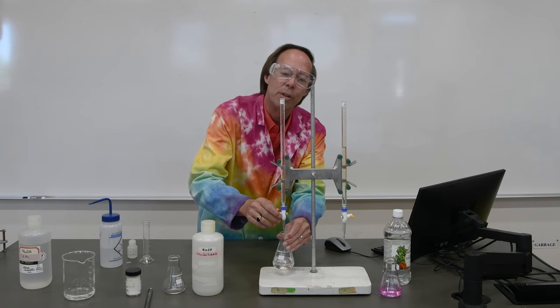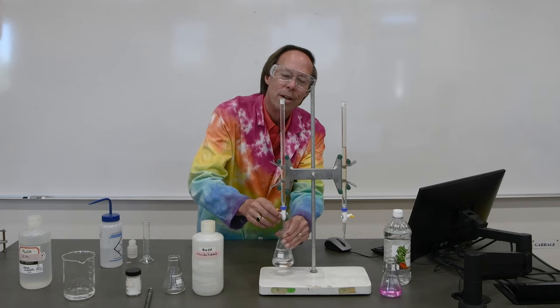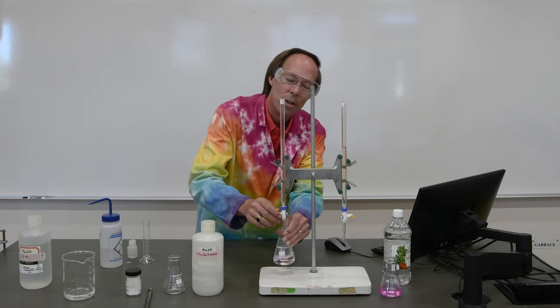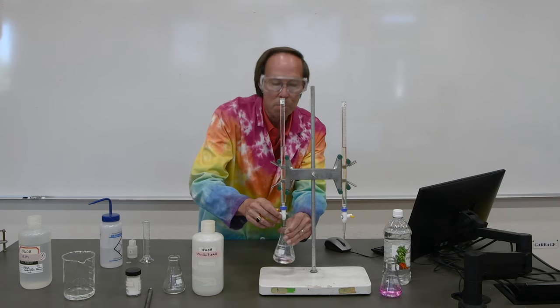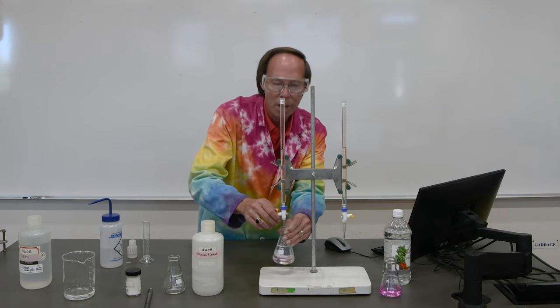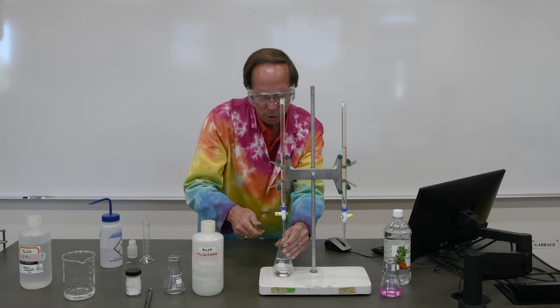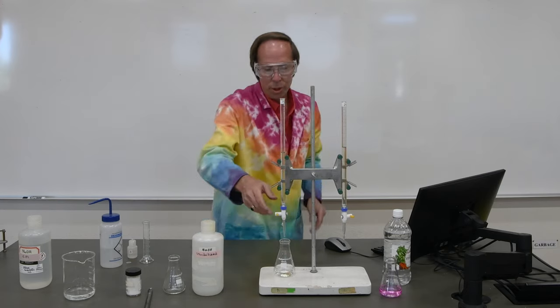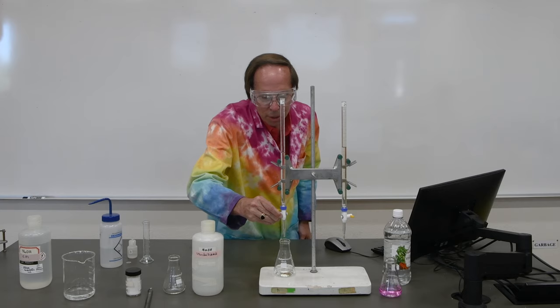So let's start adding. There's 3 milliliters, 4, 6. When we get down to about 11, we'll slow down and sneak up on it. Starting to see little bits of pink appearing there, but it's not staying, so we know we're not done yet. All right, we're getting close now, so let's go ahead and start adding it one drop at a time till we reach that end point.